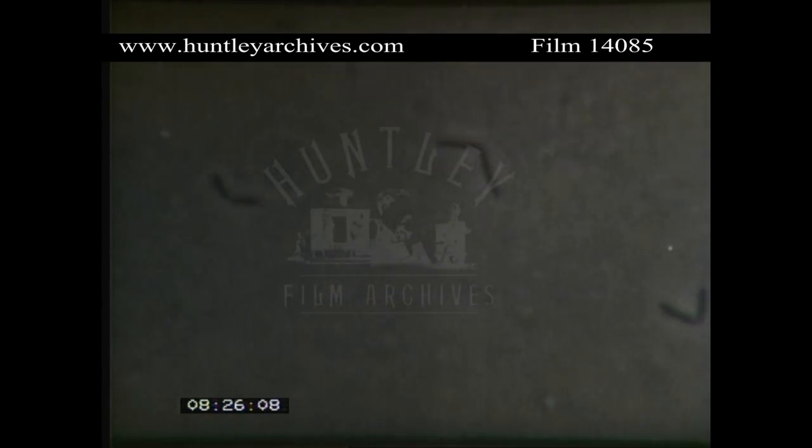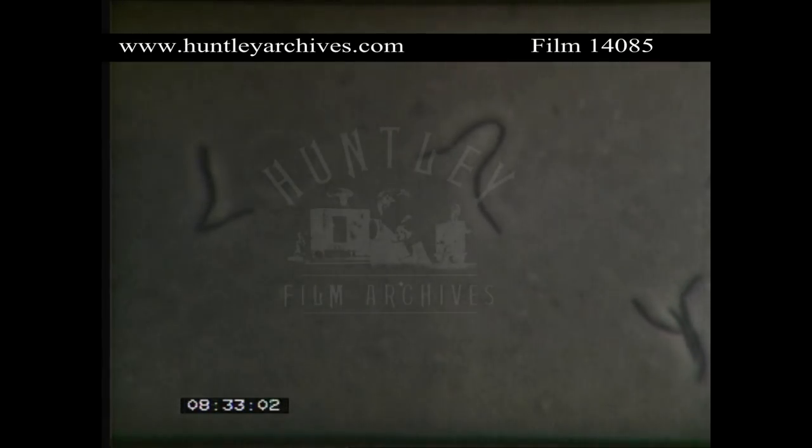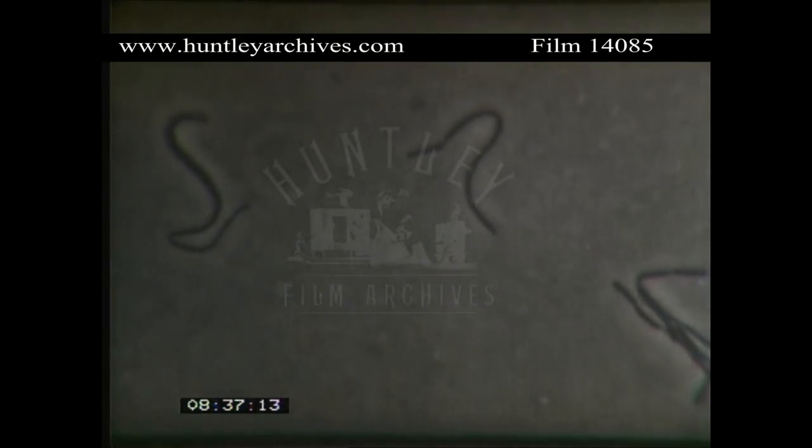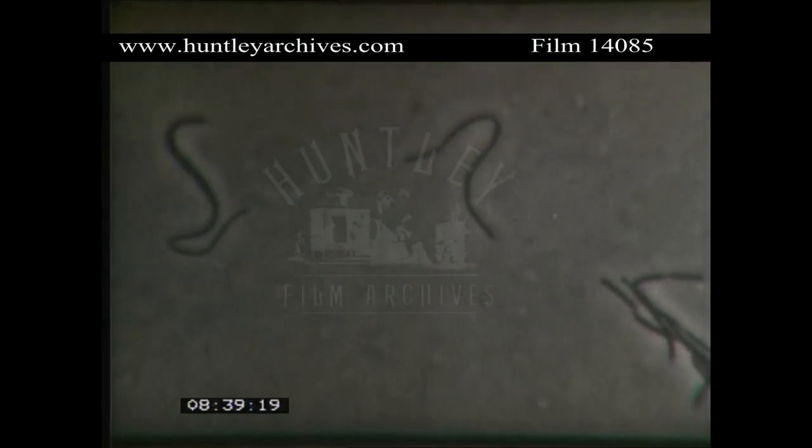When the concentration of penicillin is increased to 3 units, the typical picture of long forms is produced. The cell in the center and the one on the left are unable to divide. A less sensitive group is growing in from the right-hand corner.